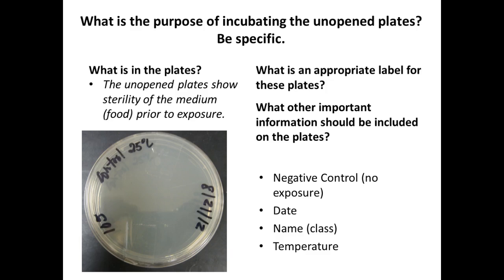Always label on the bottom of the plate, because that's where the food is. I could easily switch lids on you. We want labels where the organisms are going to grow, and they grow where the food is — in the bottom of the plate. Typically you write along the edge so that you can easily see what grows.